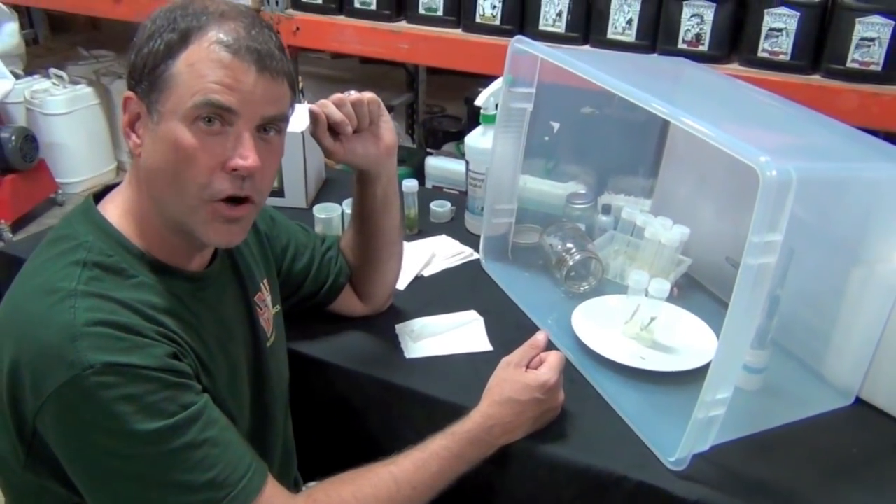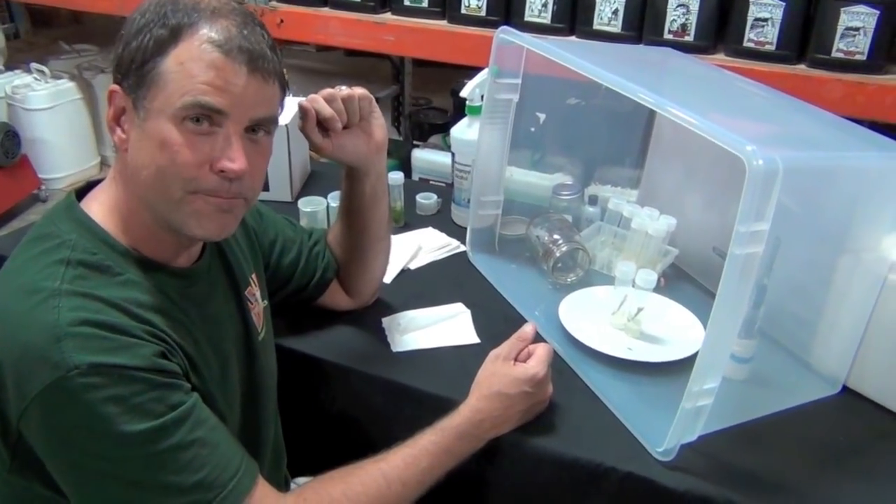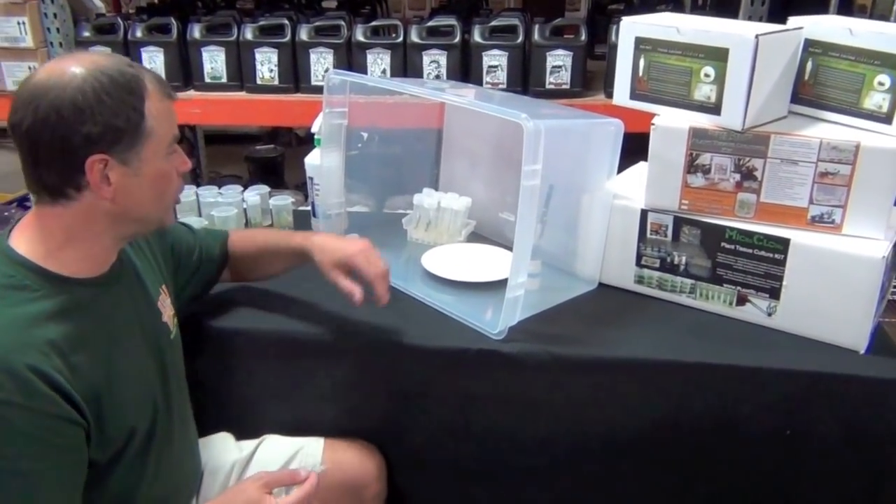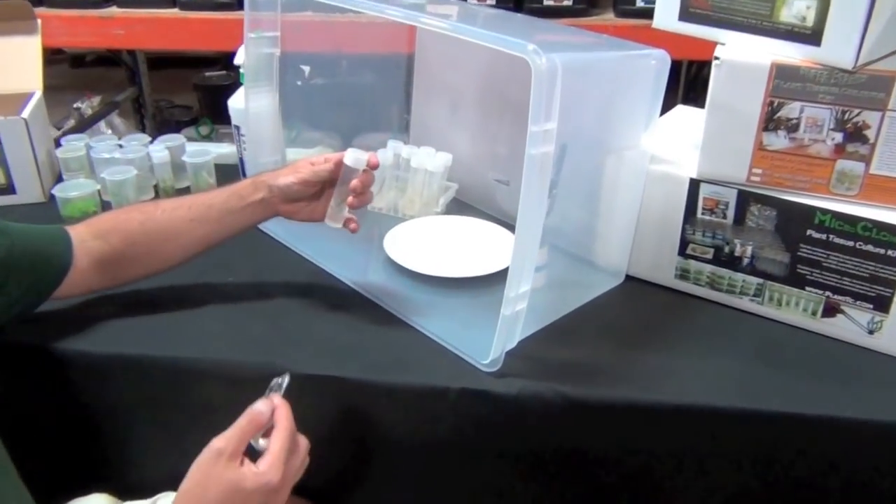Thank you again for visiting monstergardens.com. I'm Bill Graham. One thing I forgot to show you is wrapping the tubes, because the kit also comes with tape. The tape is just as an extra level of protection — I like to wrap it right around the gap from the lid to the tube.